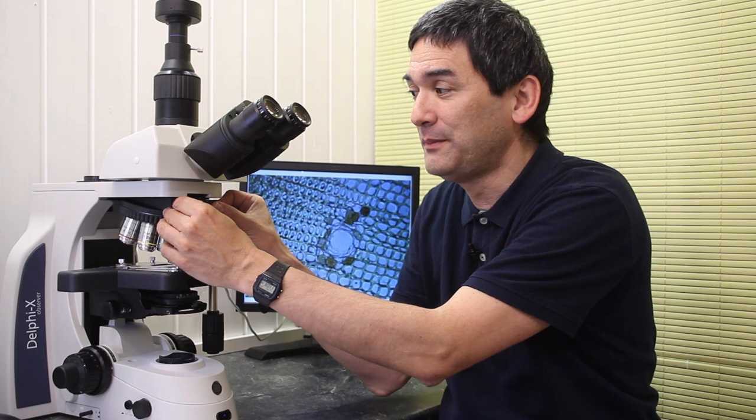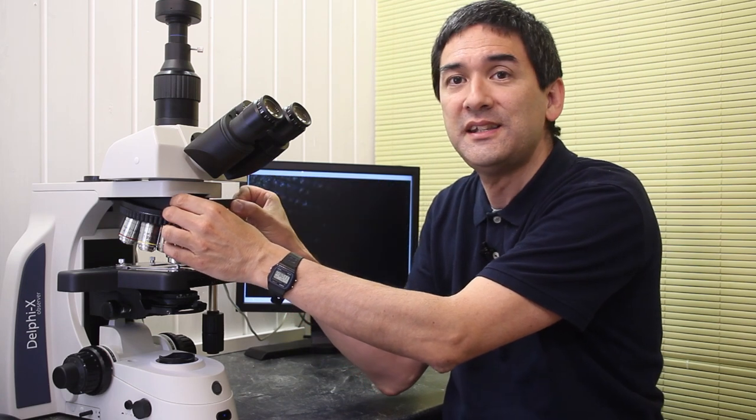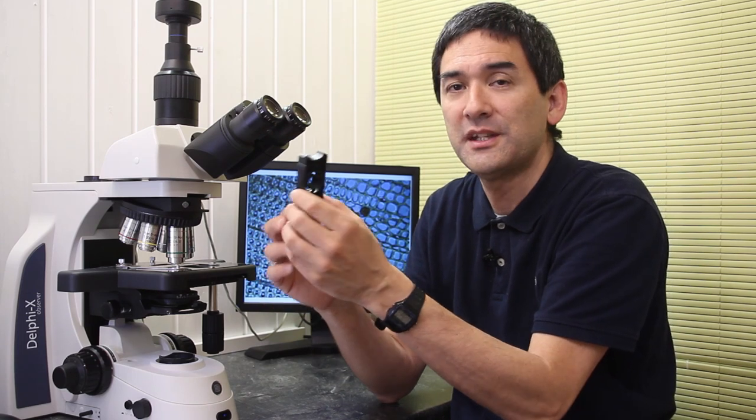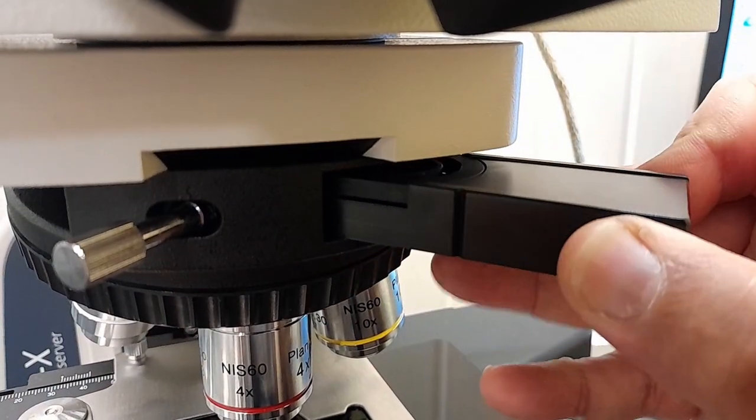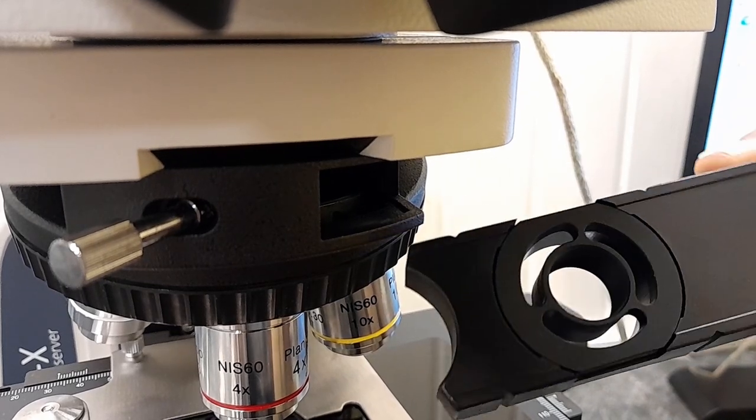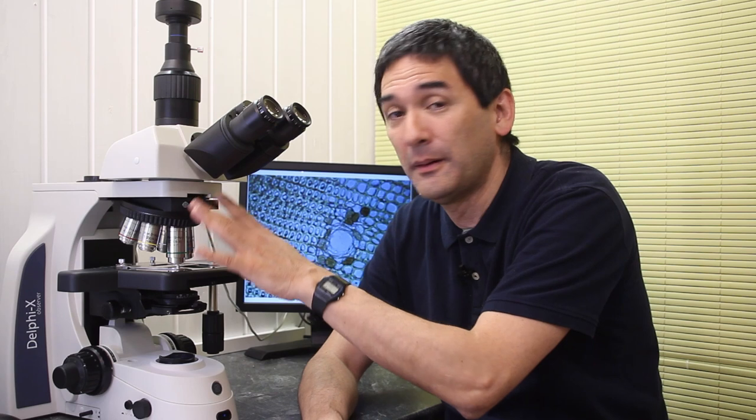But you need the light intensity because this microscope allows you to do something that many other microscopes do not allow you to do. It can be upgraded to DIC. So differential interference contrast microscopy. And for this reason there is a little screw here that you can loosen and there is a DIC slider here. And this right now it's not the prism but you are able to replace this with a so-called DIC prism and then you can get DIC microscopy. And DIC microscopy provides something that looks like a three-dimensional image of your object and it looks very colorful and it's very impressive. And this microscope is equipped with all of the parts that allow you to upgrade it to DIC as well.